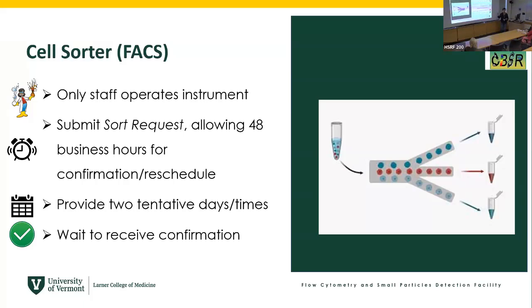Remember, the fact that you submit a request form doesn't mean that the day and time that you put will be the day for your sorting, okay? We don't have a delay on sorting of more than 48 hours.